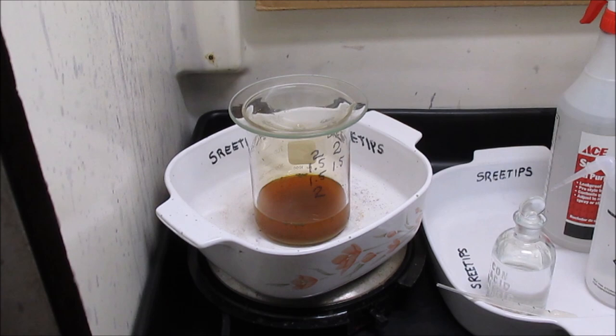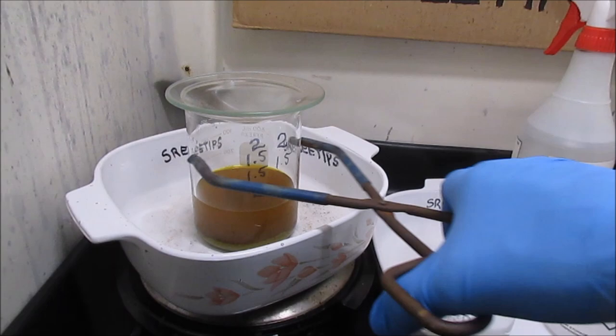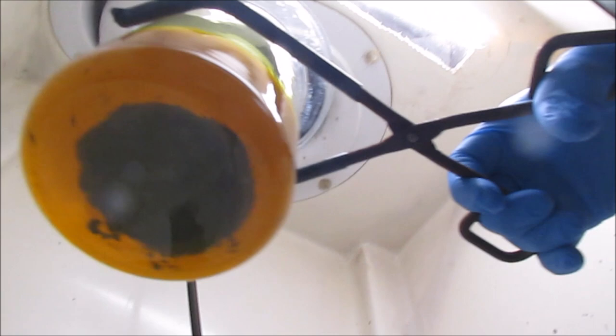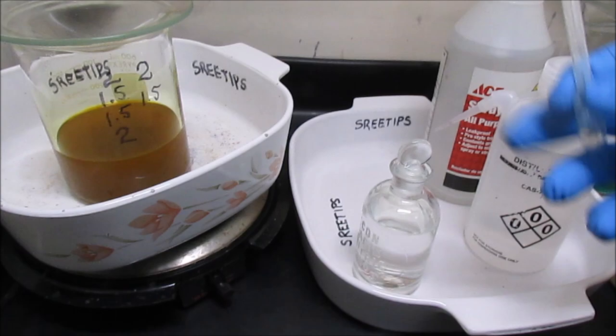Been on here about 3 hours 40 minutes. I'm gonna add a little bit more hydrochloric acid here. Take a look underneath and see what we got underneath the beaker here. We still got some solids there. I'm gonna add a little bit more nitric acid to it and see if we can get the rest of this to dissolve. This time I'm only gonna put in 1 mL.